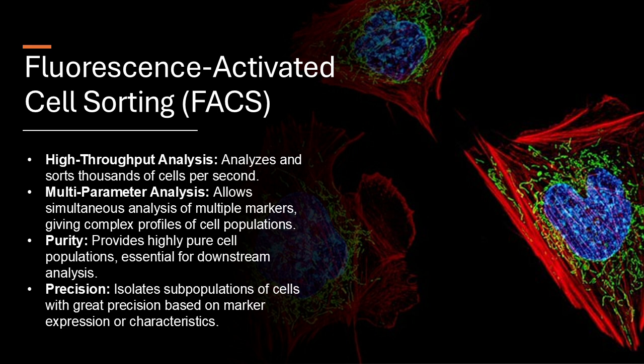What are some of the ways that this technology is being used in research and medicine today? Oh, the applications are so diverse. It spans so many fields. Immunology, cancer research, stem cell biology, drug development, the whole thing. It's really changed the way we study and understand cells.